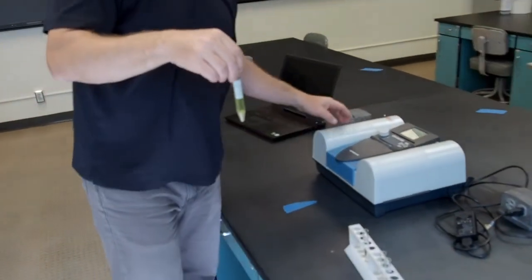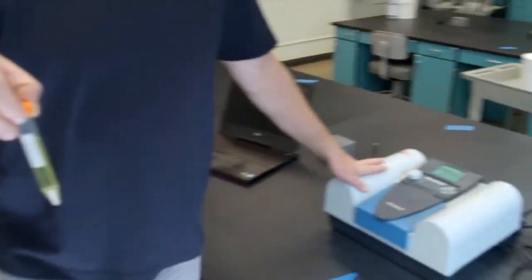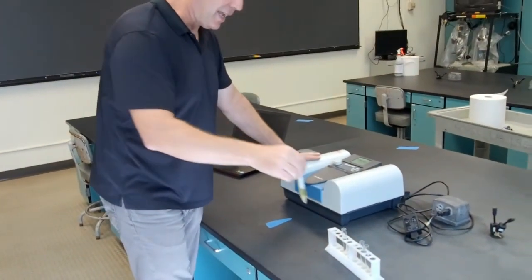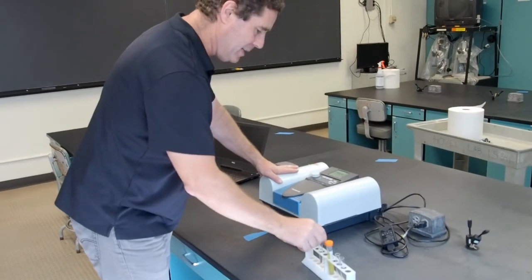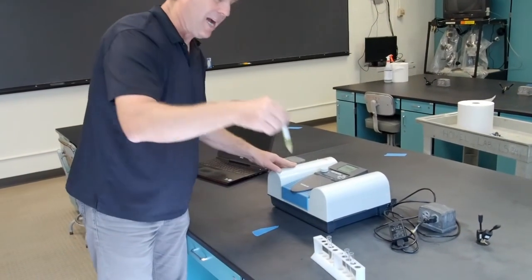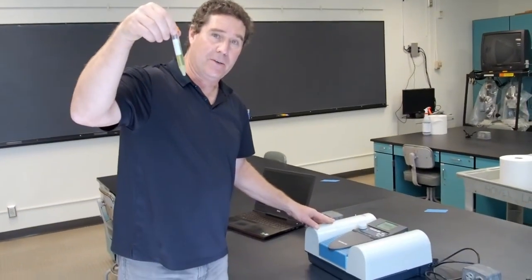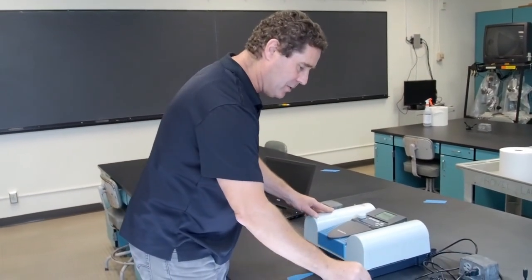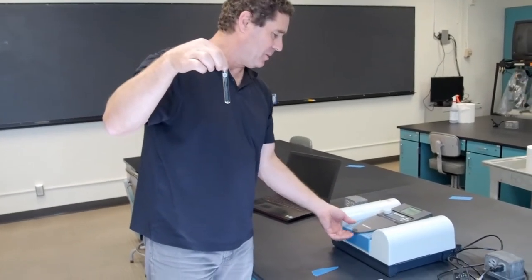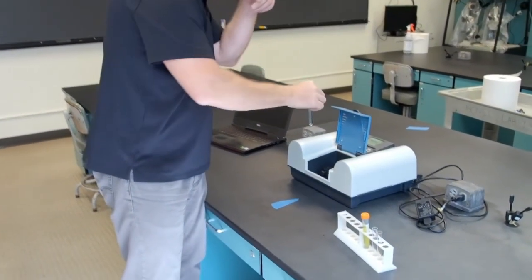A spectrophotometer is a device that lets us read either absorption or transmittance of light through a sample. Our first step is going to be to zero the spectrophotometer. Because we extracted this in acetone, we're going to use a cuvette filled with acetone as a blank. So our first step is to put this in here.